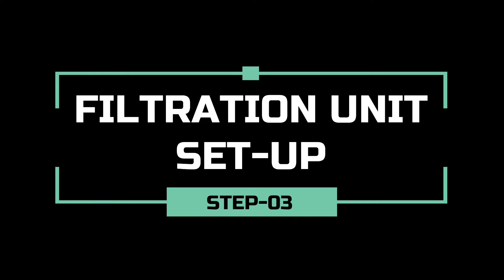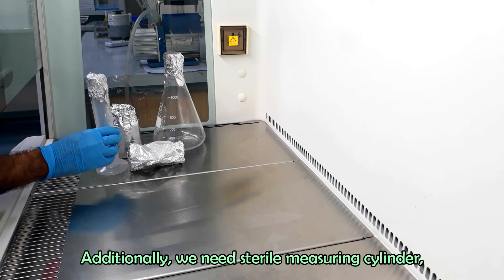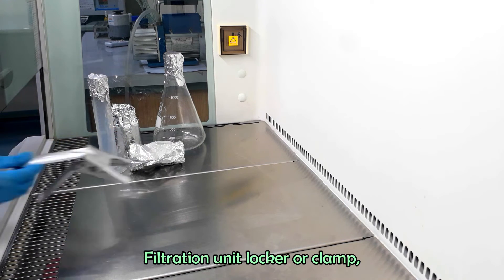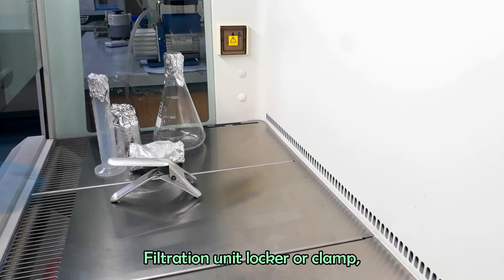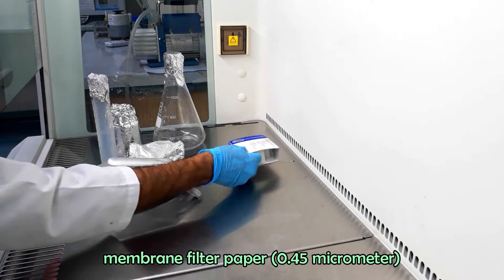Let's set the filtration unit. Take the filtration unit parts into the biosafety cabinet. Additionally, we need a sterile measuring cylinder, filtration unit locker or clamp, sterile forceps, and membrane filter paper of 0.45 micrometer.